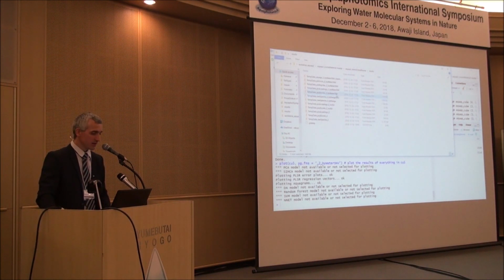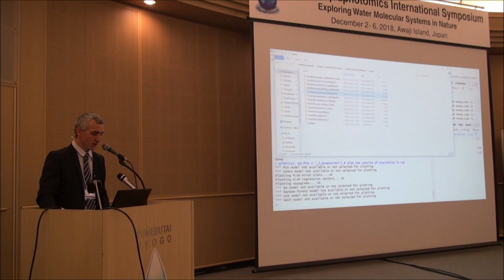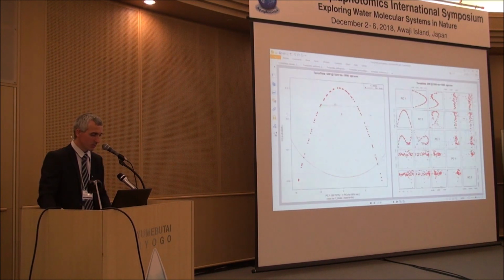So what you can see now, after executing these 2 lines, doing the calculations and then plotting the results, is that many PDF files were generated in your results folder. If we open some of them, or all of them, first we can see the PCA graphs, and now observe, here we have only one water type, and it contains 18 pages.